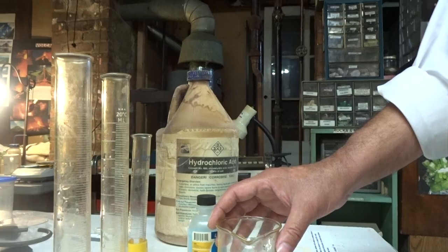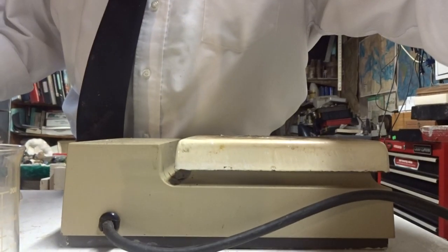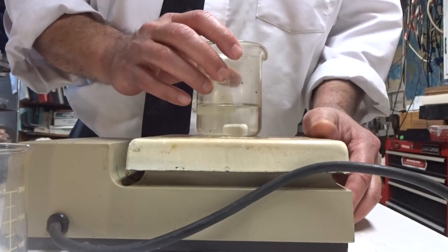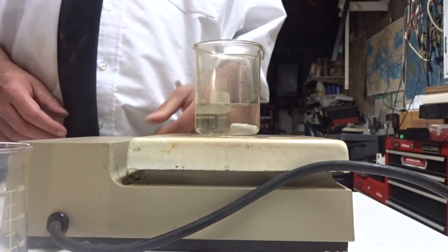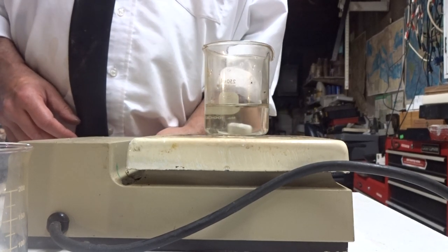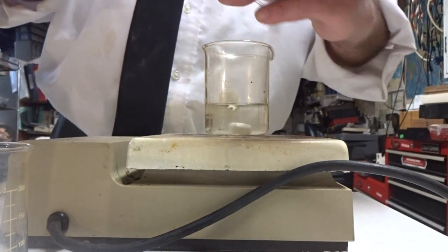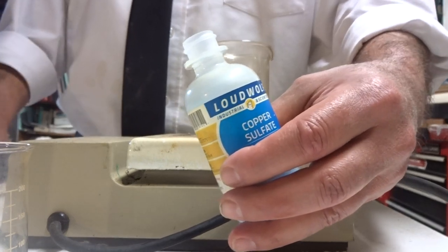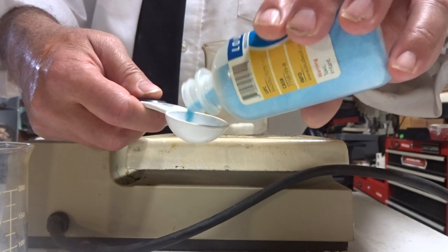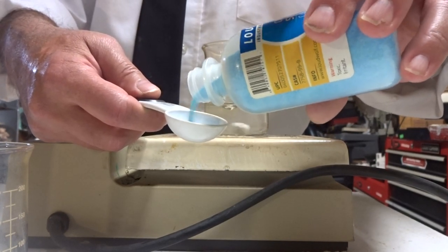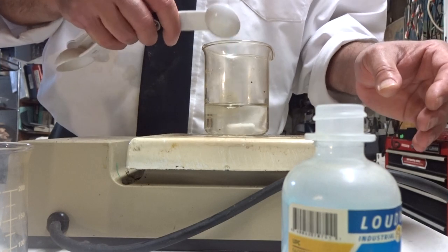Now, I'm going to put this on the hot plate. And turn on the stirrer. No need for heat, just stirring. Then I'm going to take my copper sulfate. And I'm going to add it into a spoon. I don't have to measure it precisely. And put it into the beaker.